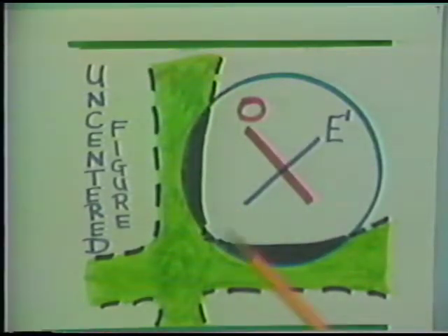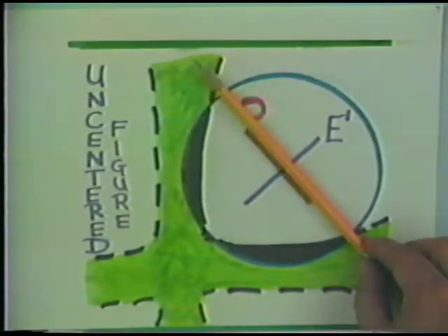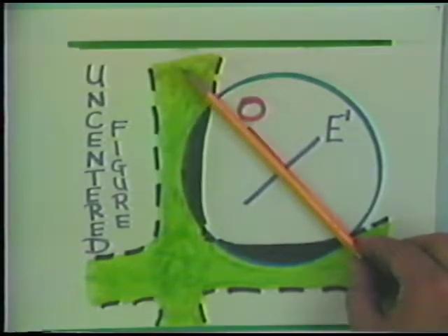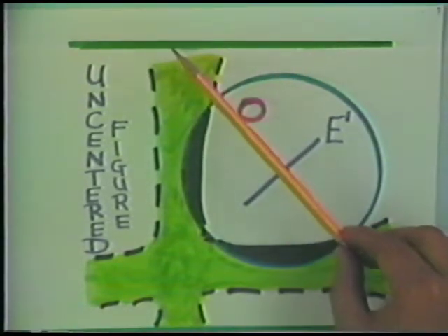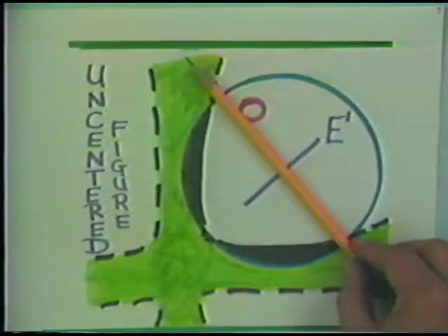And as you get the interference figure in this kind of orientation, then the O ray is always tangential to the center part of the uncentered figure. When you're looking at the northeast quadrant, the O ray is always oriented in the northwest direction.